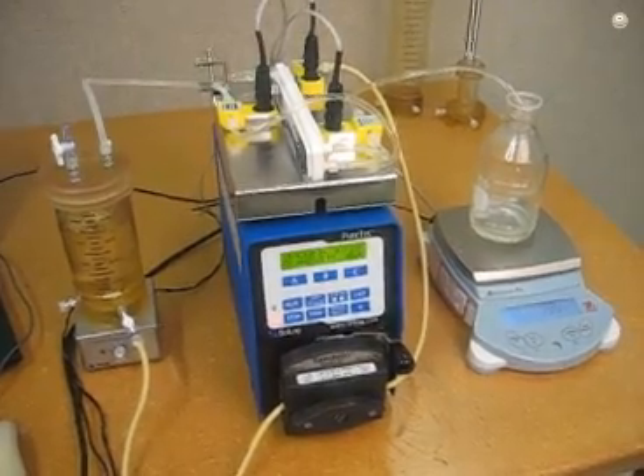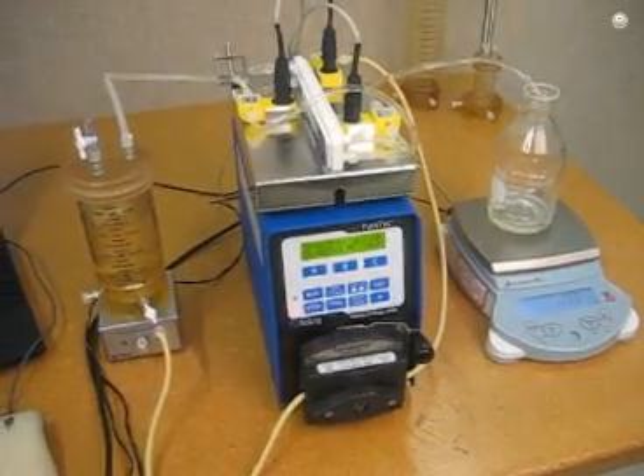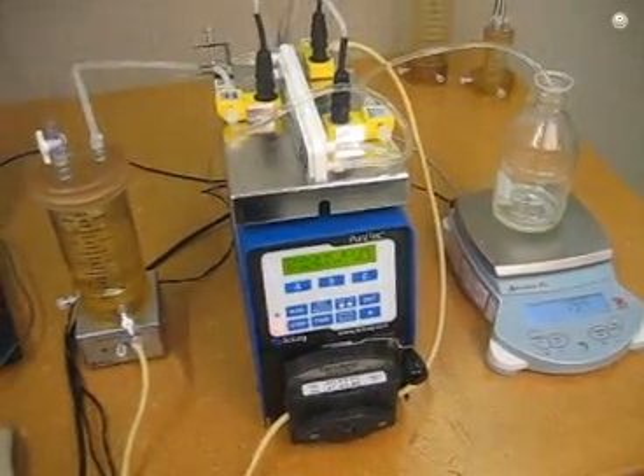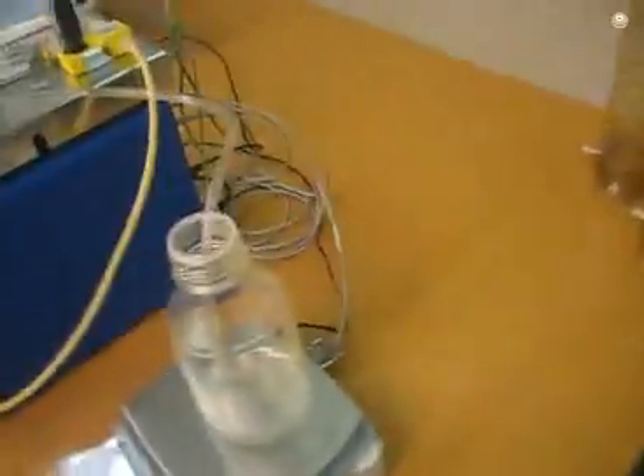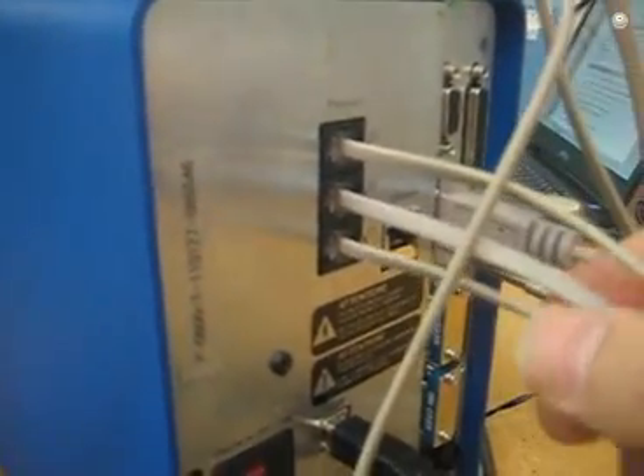In order to achieve this level of automation we need a lot of connectivity. Let's take a look at the back of the PureTech system. It's very easy to connect because all of the cables only fit in one place. Here we have the three pressure sensor connections, which are just standard RJ11 telephone connectors. They clip in just like that. There's P1, P2, and P3.